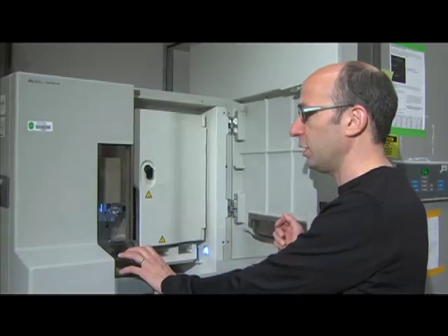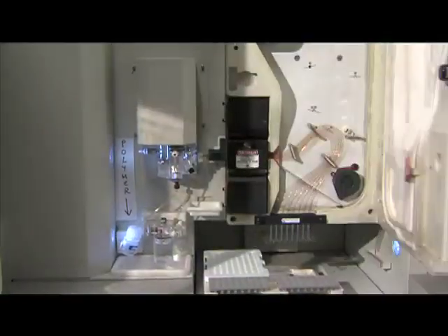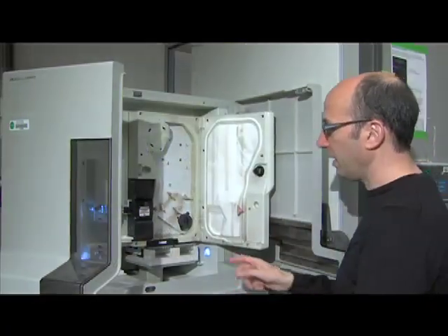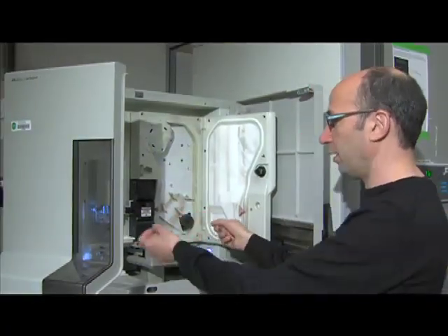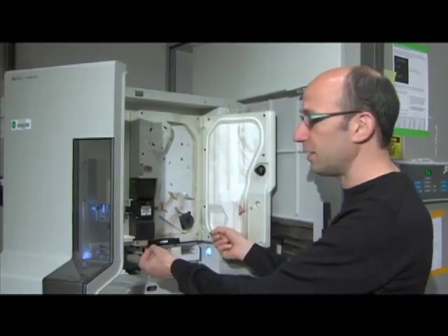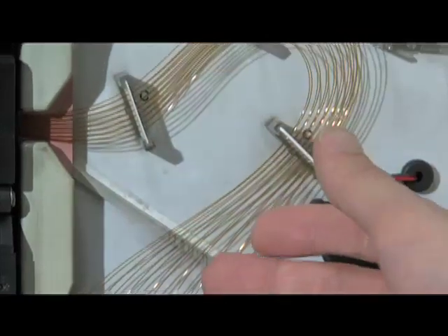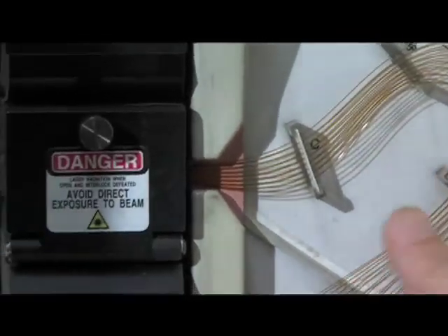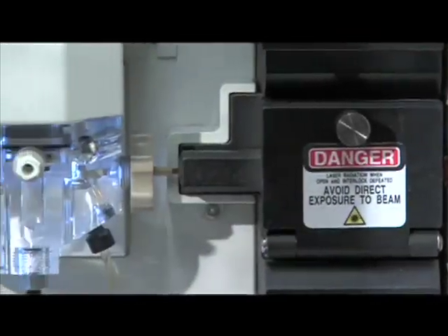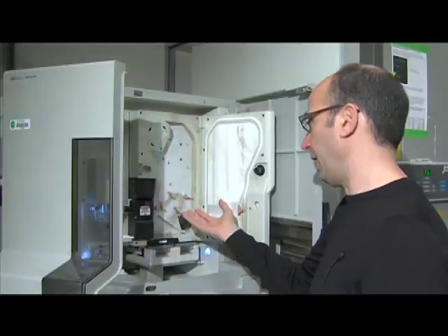At the heart of this machine, capillary electrophoresis machine, as its name implies, is a capillary. And these capillaries are, in the same way that a gel allowed you to separate on the basis of size, a capillary would let you separate DNA on the basis of size. The DNA would enter here, there'd be a strong electric field that would pull it through the capillary, and the time it took to go through this capillary and be detected by the laser, which would be here, would tell you what the size of the DNA is.